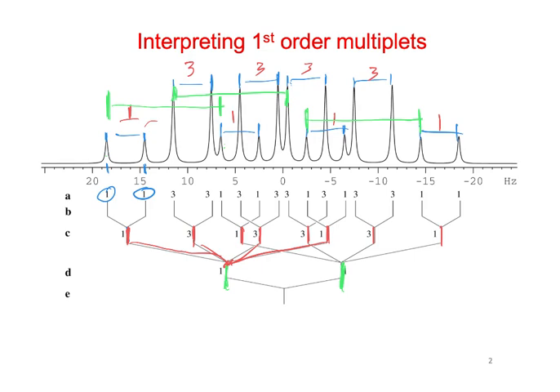So we could call this, I'm not always sure, I always kind of just do the small ones first, but so doublet of quartets. I'm not really sure if there's a rule on the order, because we kind of analyzed this as a doublet and then a quartet and then a doublet, but whether it's a doublet of a quartet of doublets or a doublet of quartets or a quartet of doublets, I'm not sure if there's a rule about whether you do them in the order of the size of the coupling constant or something like that.